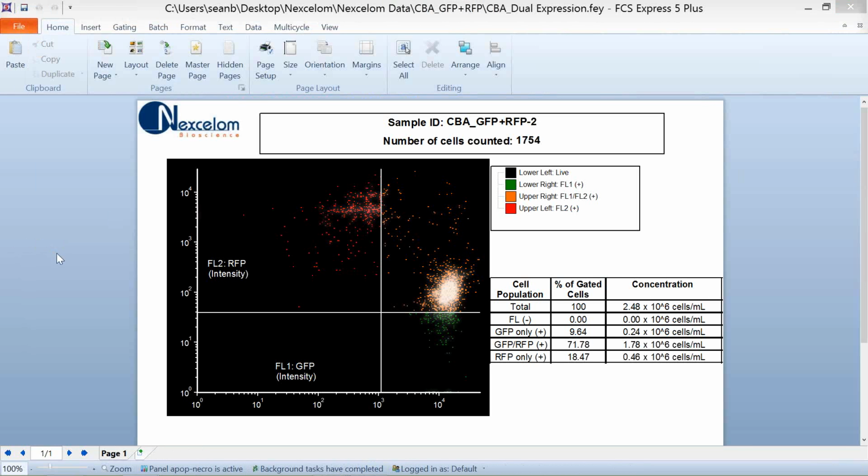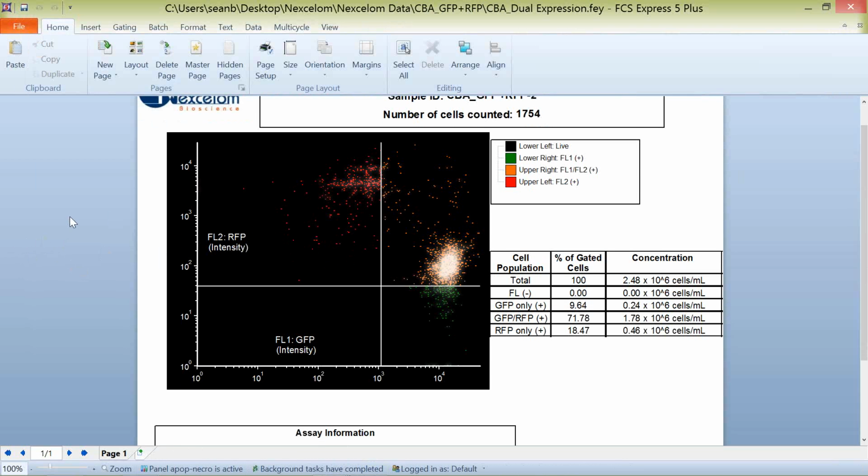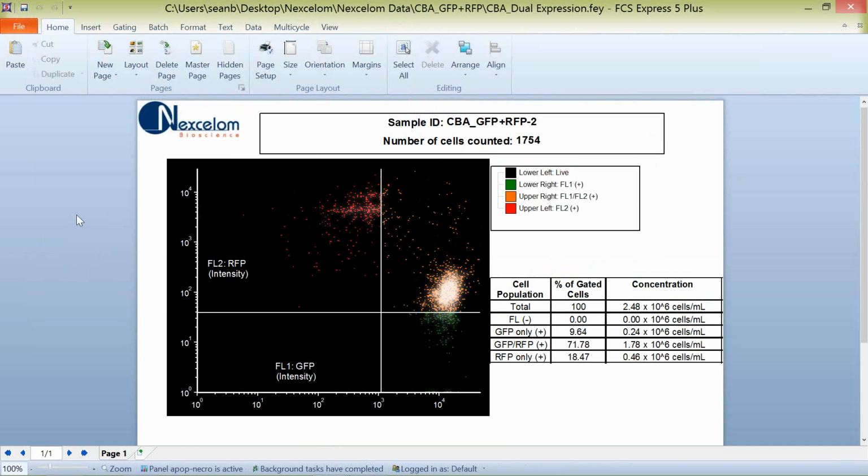All right. So you can see here one change that I made to this, besides the density with shading. I think it looks very nice on a black background. It really highlights what you can see here. But what I wanted to focus on is when you're creating templates and you want to use something like a black background on a plot, you want to use white quadrants and white ticks and markers. It's a more modern style for working with some of these plots.